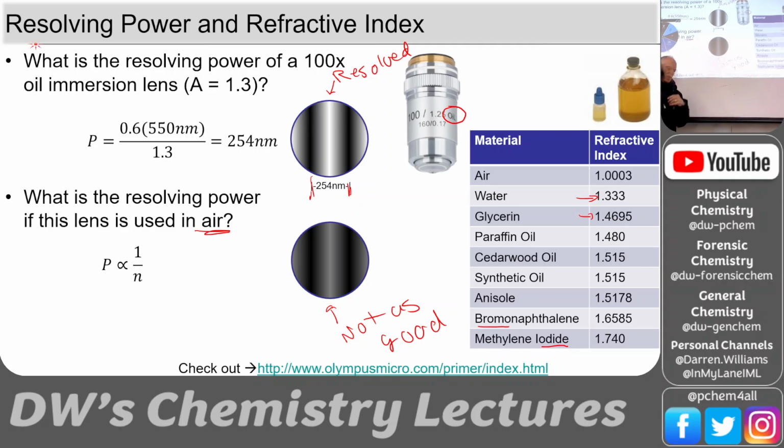So light comes in, it's oscillating, interacts with an electron, it goes this way. That's Rayleigh scattering because the wavelength of the light hasn't changed. But what if light comes in, oscillates with the electrons, and goes again in the same direction? That's refractive index. So it's the same direction. If it was a different direction, it'd be scattering. It's bounced off. But if it's in the same direction, it's refractive index. And most of the light continues in the same direction.